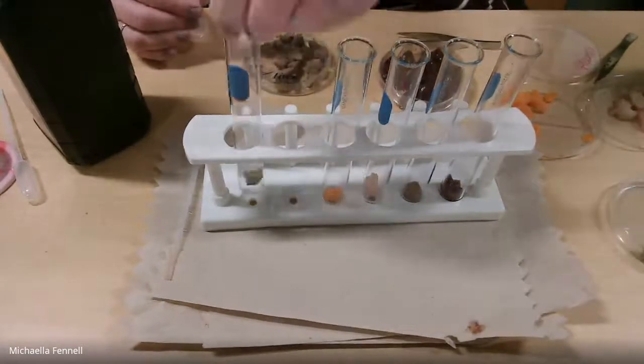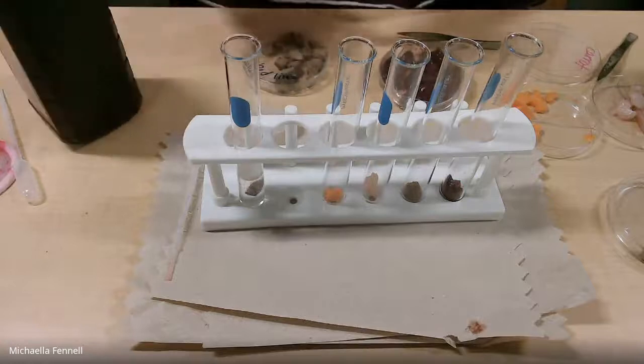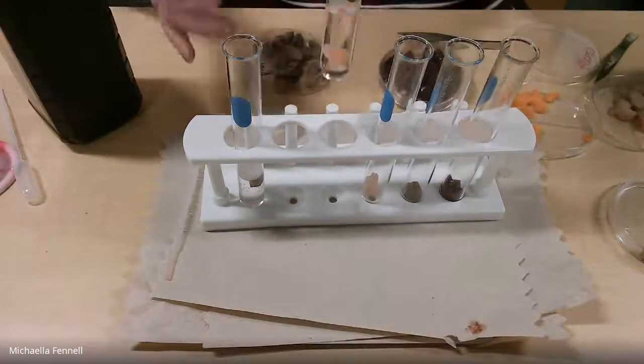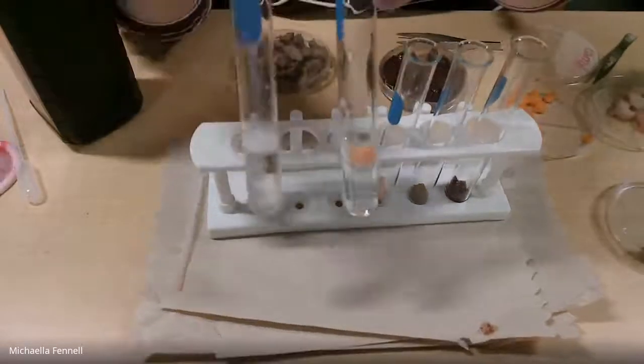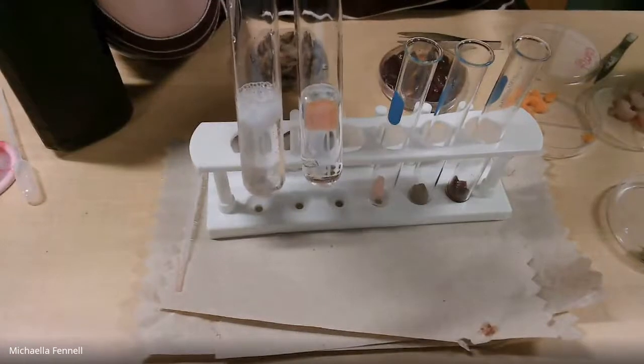All right, the next one we got is carrot. It's kind of funny, the potato is still reacting. I still see fizzing occurring in that test tube. Then we have the carrots, and if I compare these two, I can tell you right away that I think the potato has more going on than the carrot.